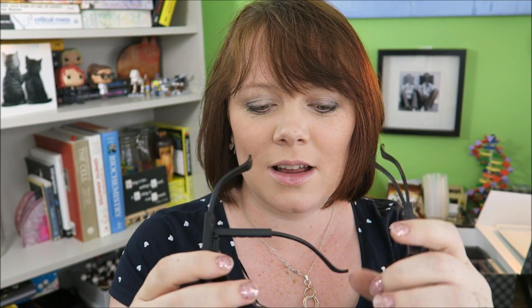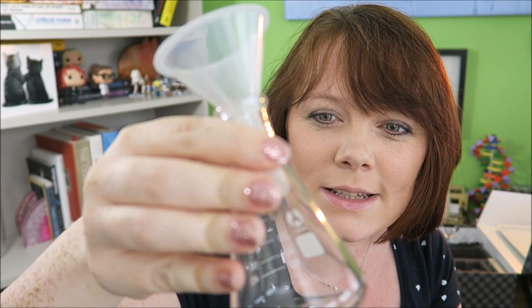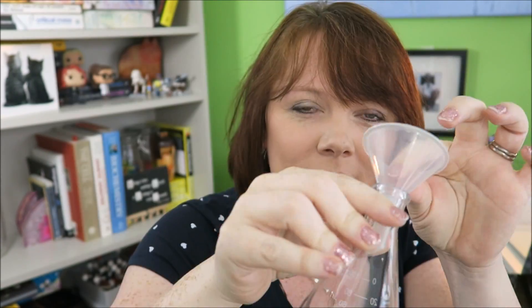Goggles. And look, you can actually see through them. Every single time I tell you to put goggles on, they're like, 'Miss, I can't see through the goggles.' These ones — look. I might take this into school and keep this as my school pair. You can actually see through them. And there are two sets of goggles, and you can see through both of them. Tongs, conical flask, and a little funnel. Really excited to have my own conical flask because I don't have one of my own.